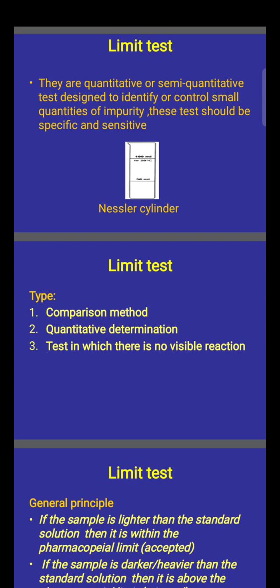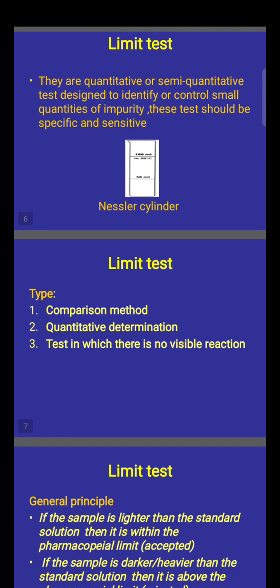In short, what does the limit test mean? It is a quantitative or semi-quantitative test designed to identify or control small quantities of impurity. This test should be specific and sensitive.